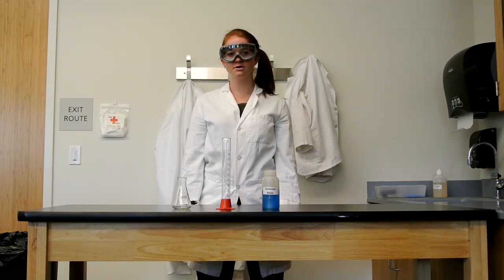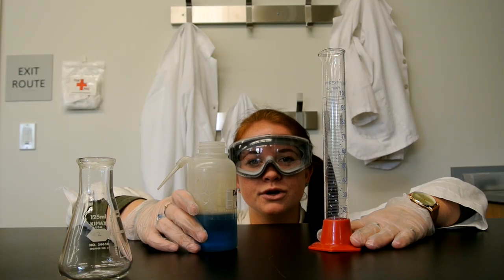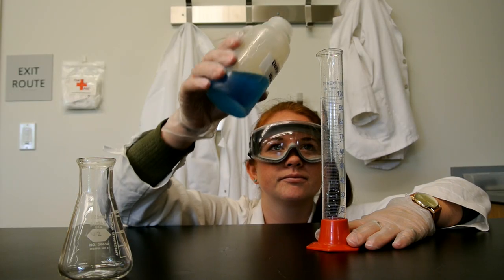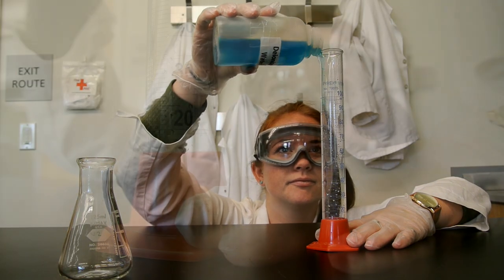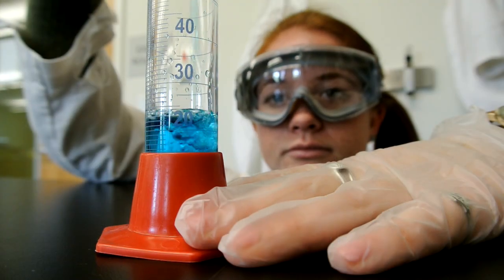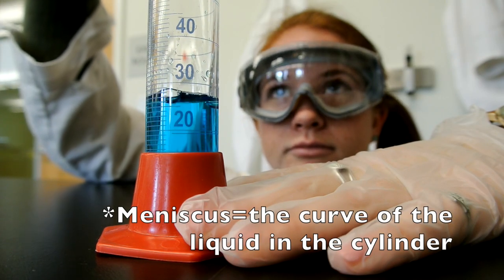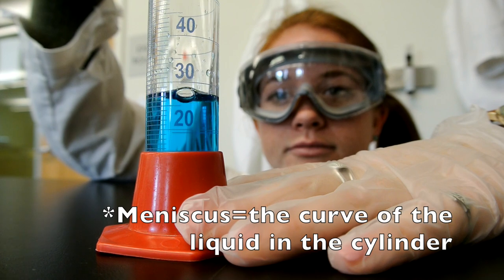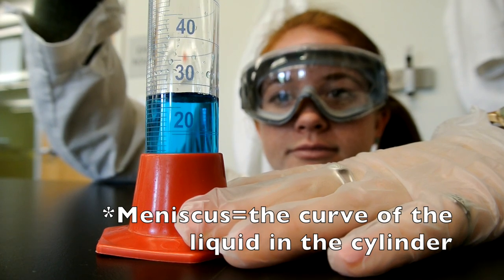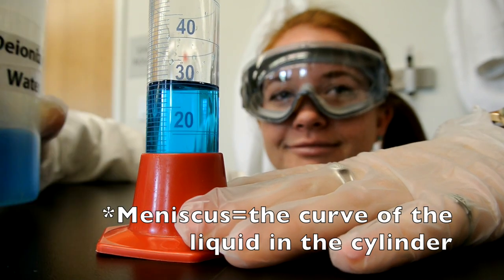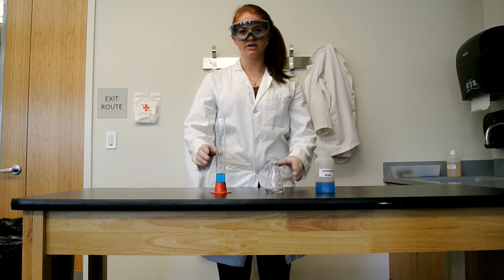Be at eye level while pouring so you can see the bottom of the meniscus reach the line of desired measurement. I'm going to measure out 30 milliliters of deionized water. Now, transfer your solution into the flask.